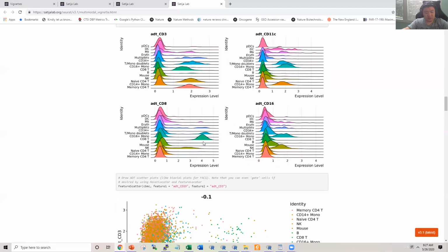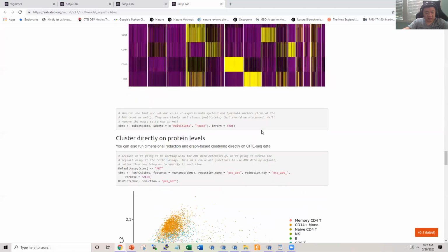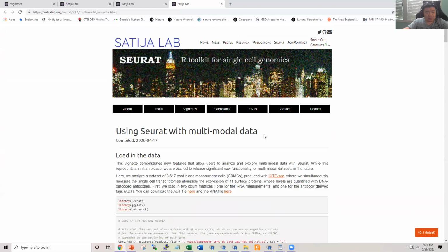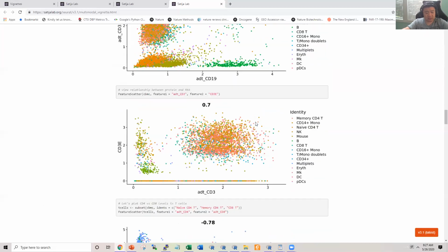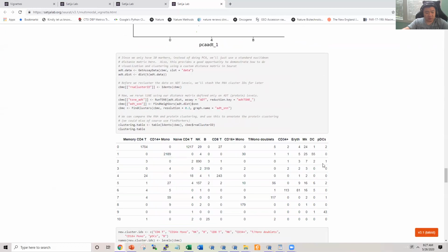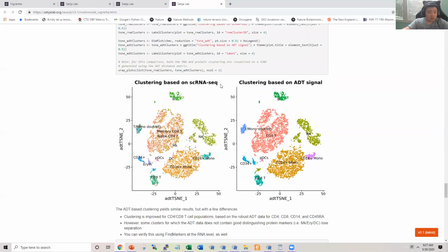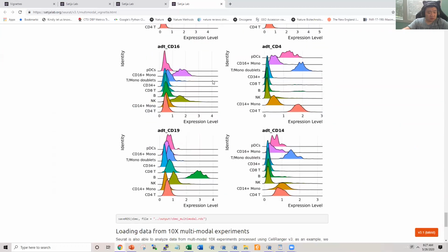So more detailed parametric tests are needed. Actually, Seurat has a very good concept in analyzing this multimodality, but the problem is that Seurat so far is not encoded with a good multimodal distribution to characterize the multimodality. But this plot can directly tell you something about the mechanism.